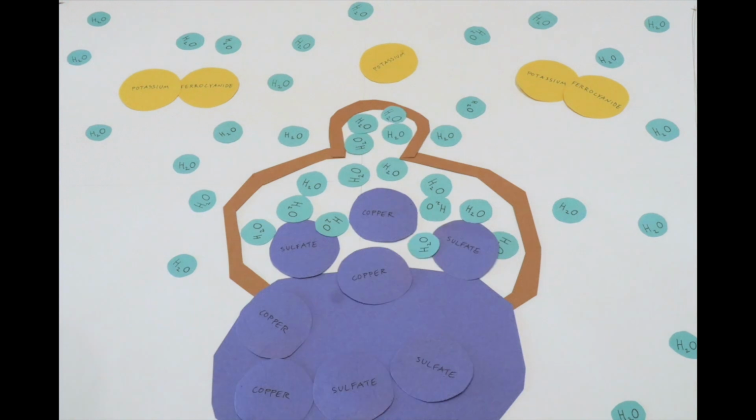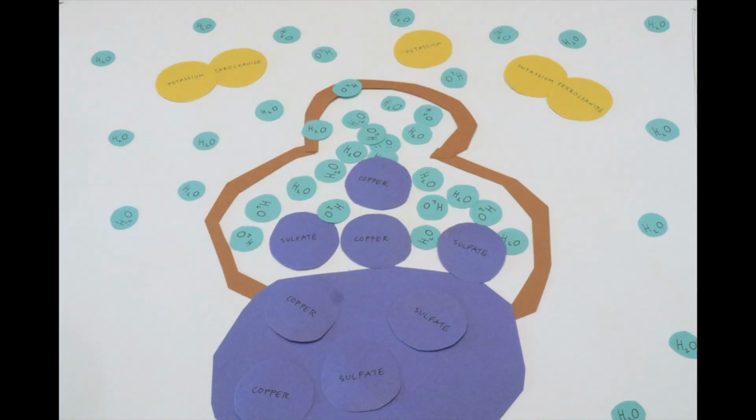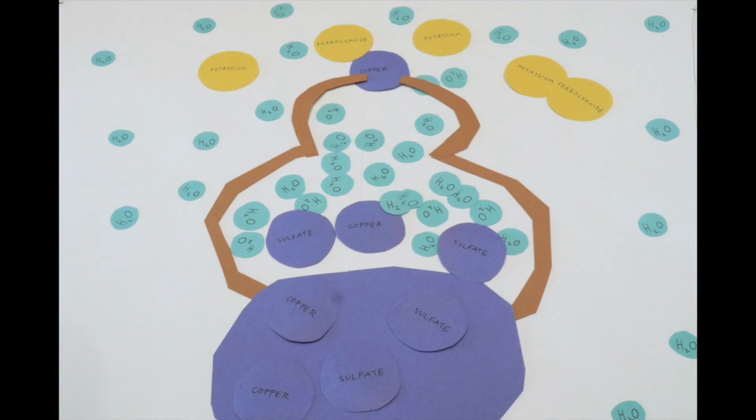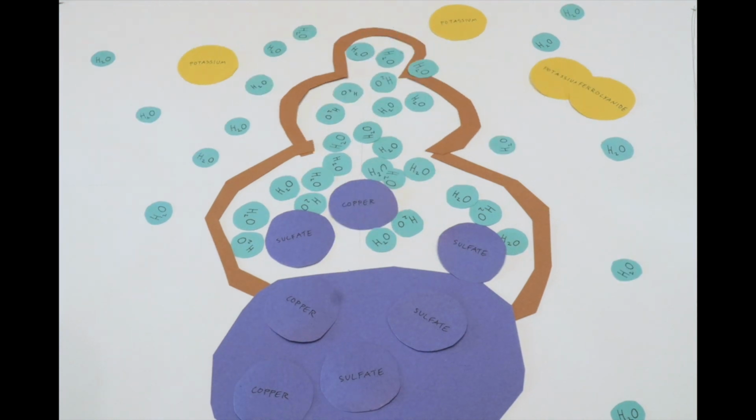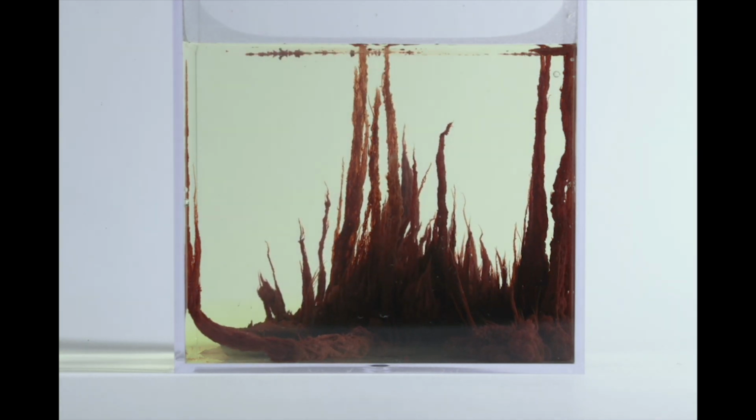But something really cool is happening here. Each time a cell bursts, a new cell is formed, which then bursts again, forming a new cell, bursting again, and so on and so forth. This is what makes those growing spires. The reaction ends when all of the ferrocyanide or copper has been used up.